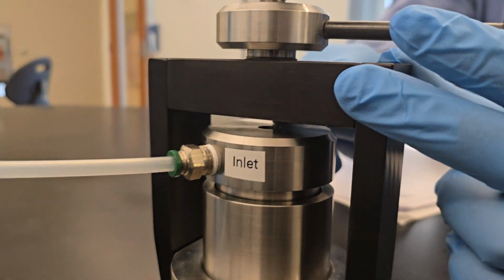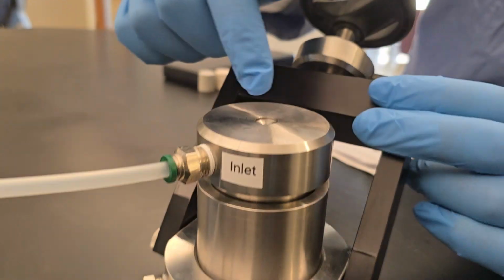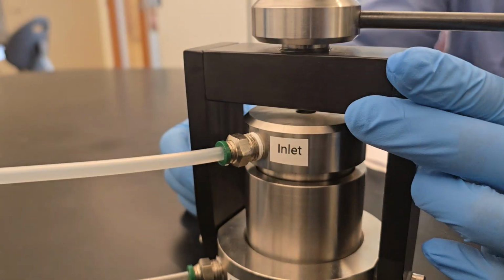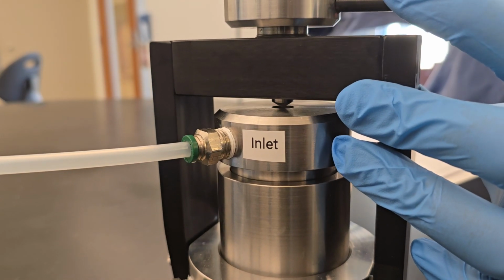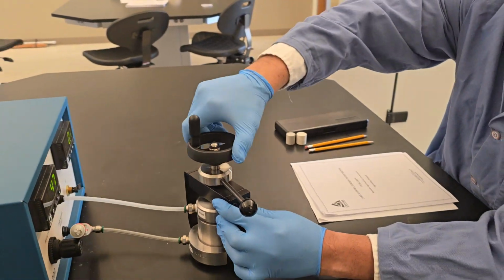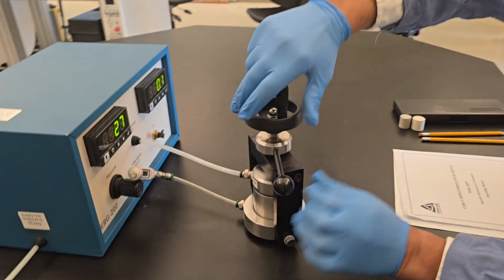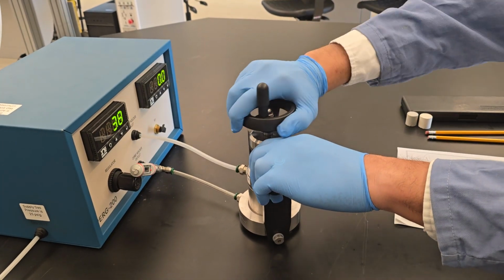There is a screw in there, you may be able to see it. Make sure that the screw goes in this groove. There's a groove here for the screw, so you may look by the side and make sure they get in. So I'm moving right there. Tighten, tighten, tighten. Okay, has to be very tight to prevent and stop any leakage.